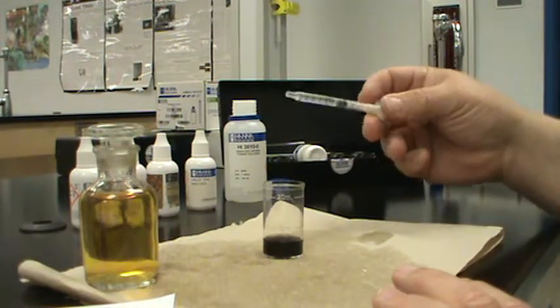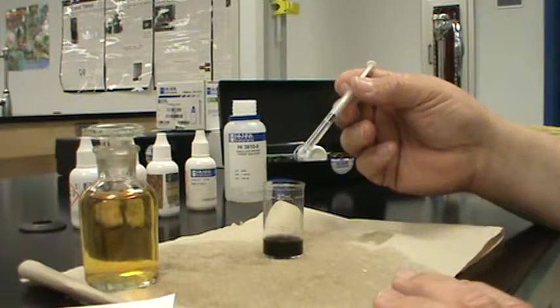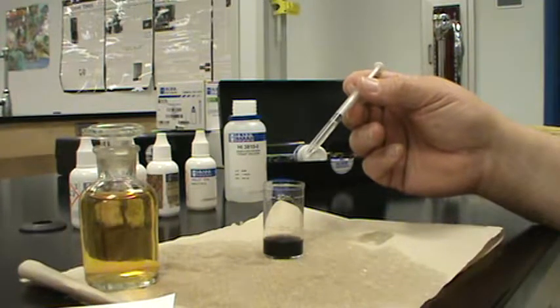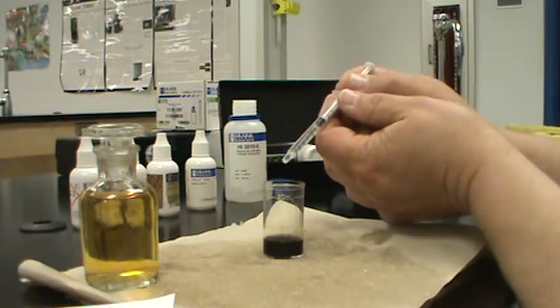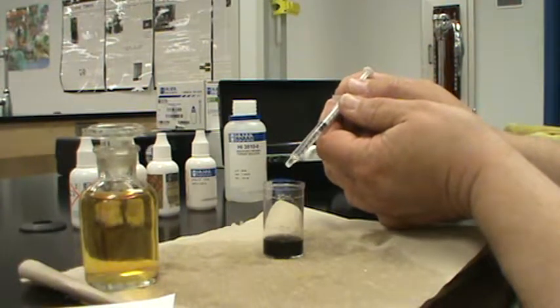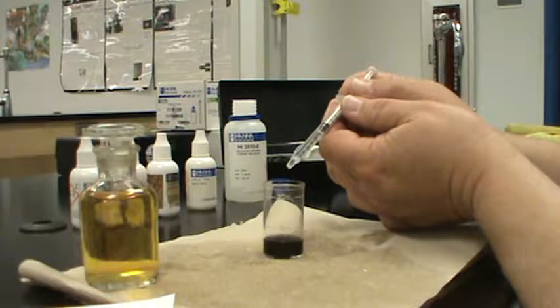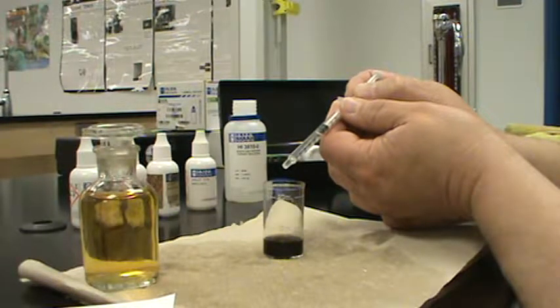Then we're supposed to add drops of our titration. Now remember, each drop is approximately 0.03 milliliters, so 3/100ths of a milliliter. So here we go. We're going to do this 2 drops at a time, and we're going to get this to change from blue to clear, and it's going to change all of a sudden. So we add our 2 drops.